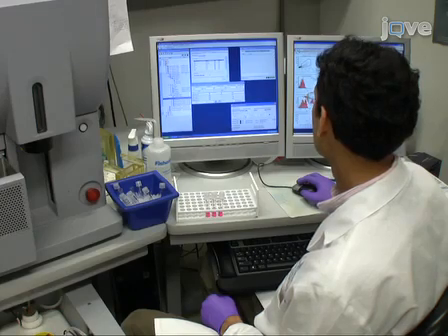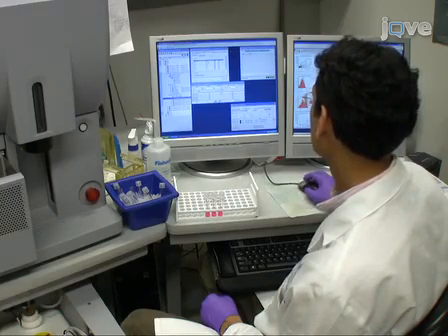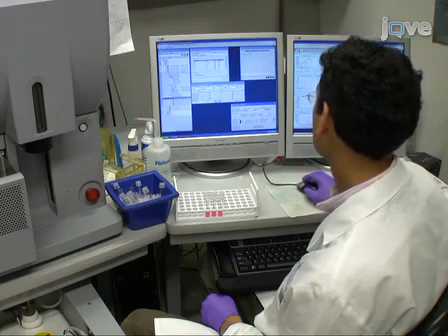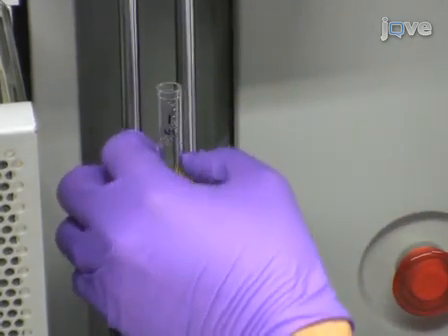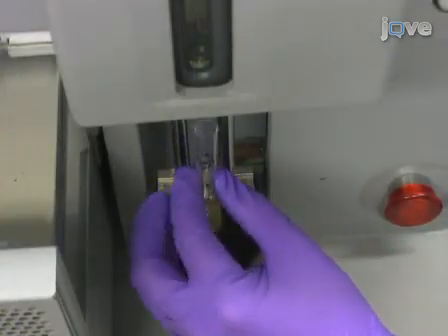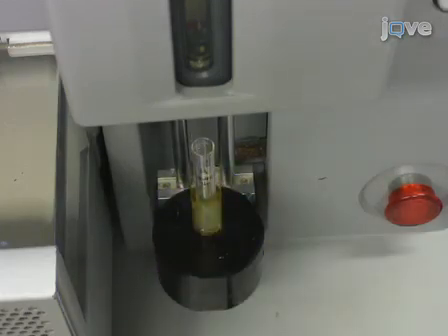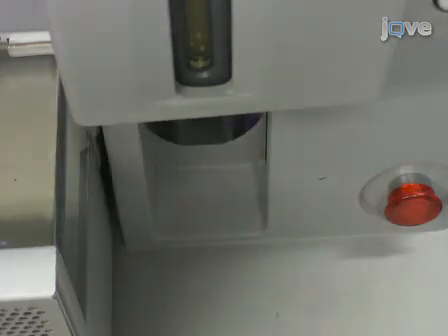Using the non-stained, CD44 APC, CD24 PE, mouse lineage, and Aldefluor cells, set the compensation controls on a FACSAria flow cytometer. Generate gates based on forward and side scatter parameters to collect cell singlets. Use the non-stained and mouse lineage tubes to create a gate for non-mouse PerCP negative and viable propidium iodide negative cells using the FL3 channel.